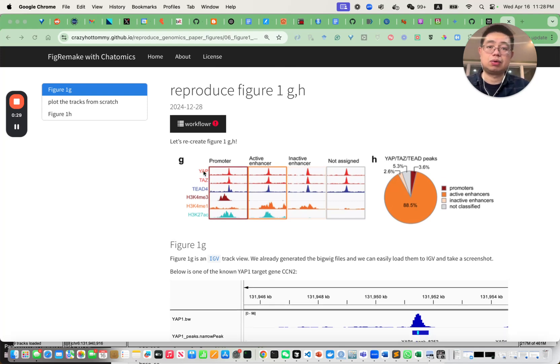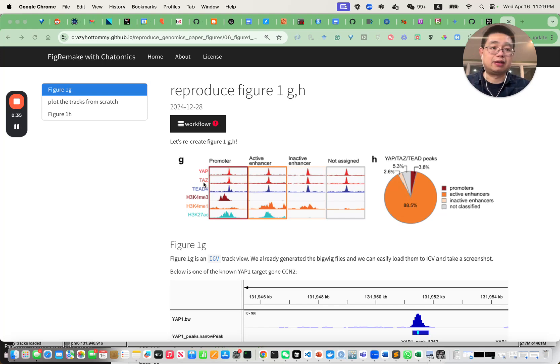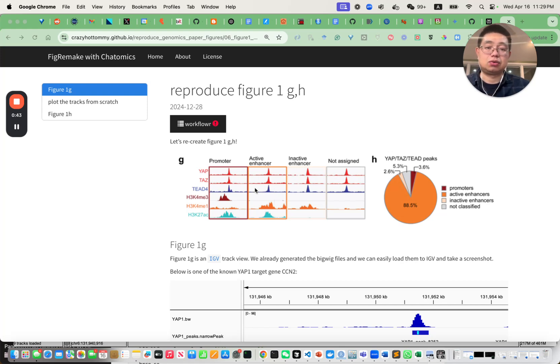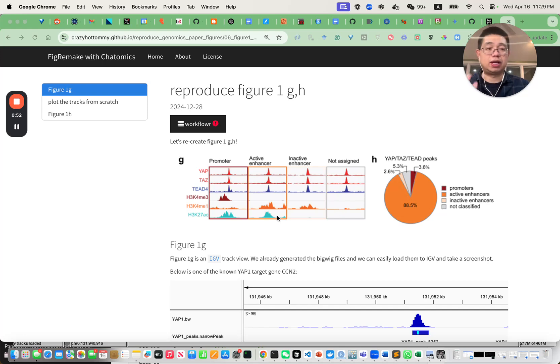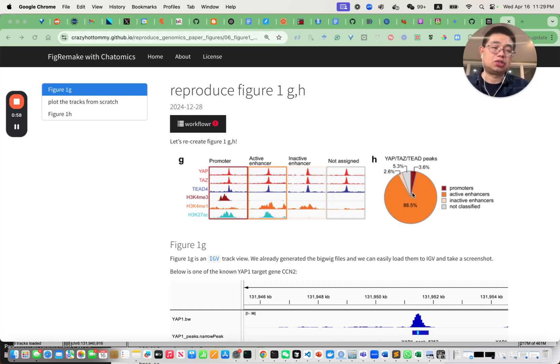Today we will try to reproduce figure one G and figure one H. For figure one G, if you are familiar with ChIP-seq data analysis, you instantly recognize this is just an IGV track view for the raw signal file — the bigwig file — which we actually produced in the previous video. Make sure you check that out. And for figure one H, this is just a pie chart.